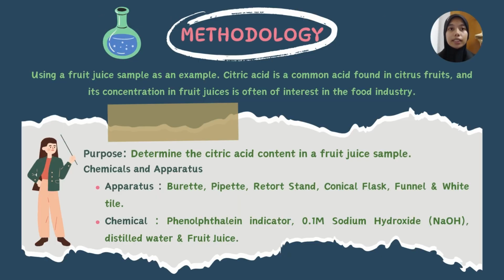Hi, I'm Shaya. So next is our methodology. For our methodology, we're using an experiment with a fruit juice sample.